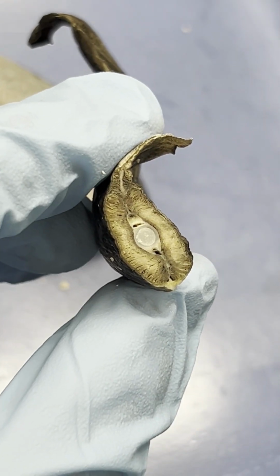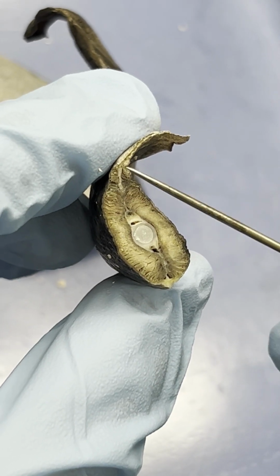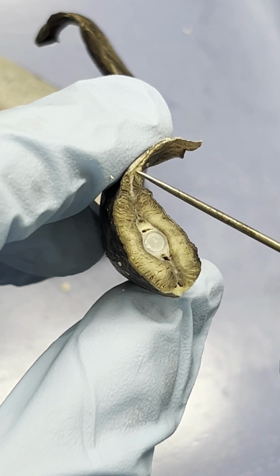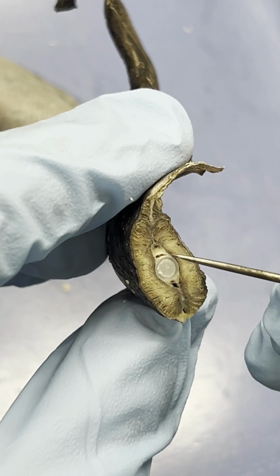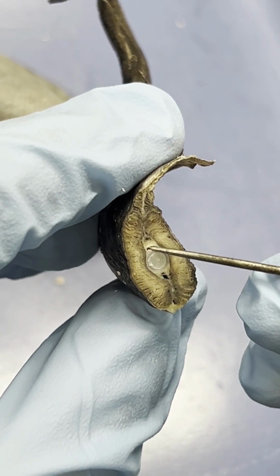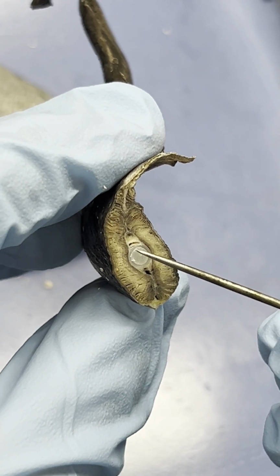So the first structure that I want to talk about that's on our lab assignment is going to be the fin ray, which is right here, basically the fin. We also have the spinal cord. The spinal cord is going to be this opening right here in our cross section. We also have the notochord, which is right here.